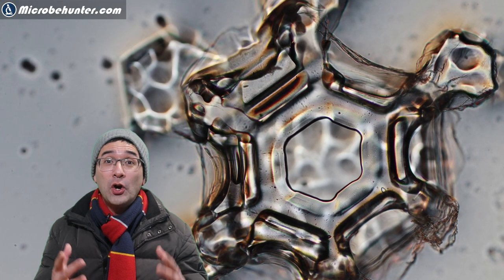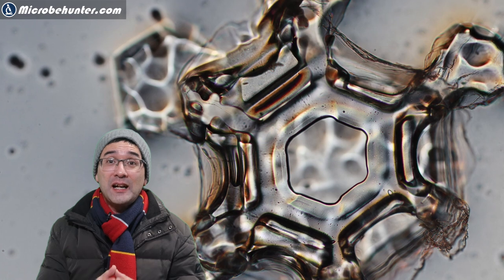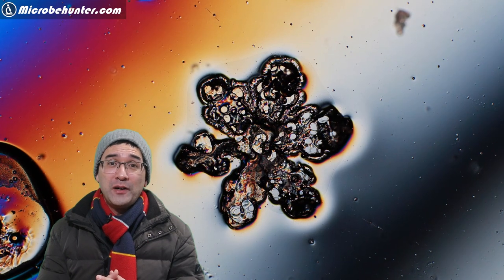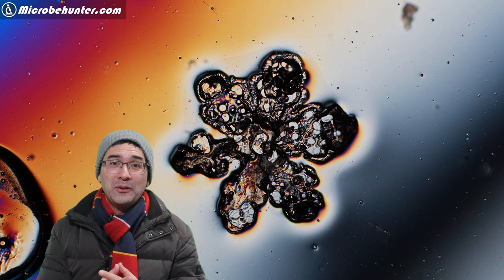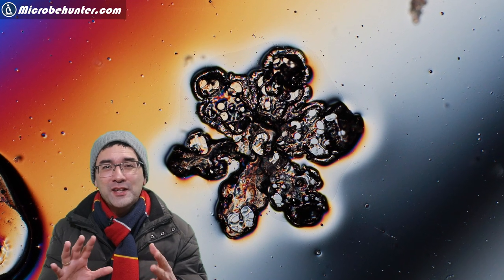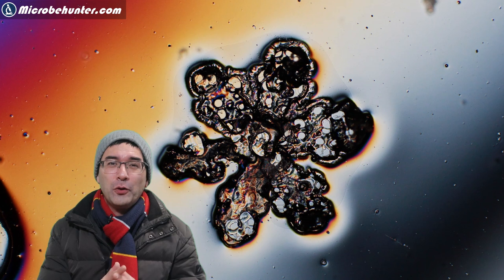Well, in many cases snowflakes are hexagonal. They have six sides, but there are many other structures that are also found. This one over here is also quite nice, but I think it already started to melt a little bit so it looked a little bit deformed.